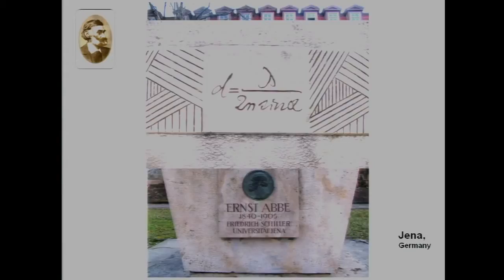Of course, detection sensitivity has evolved over the years. In fact, it's possible to detect even single molecules. However, if two molecules come very close, closer than the distance d, we will not be able to tell them apart. Resolution is about the ability to separate small things, not about sensitivity. You can be as sensitive as you want, but if they come very close, closer than the distance d, you reach a limit. And this is the problem that we want to fix.